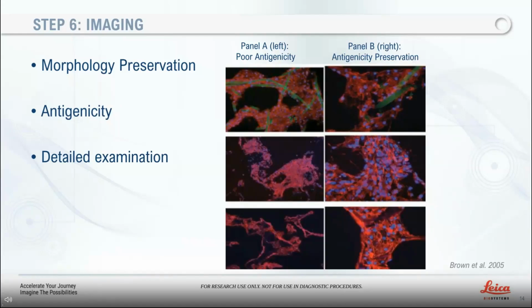Using cryosectioning for immunohistochemistry and fluorescent in situ hybridization allows for tissue with better antigenicity, makes your cutting much faster, and will create beautiful thin sections, even monolayers, that will provide the level of resolution needed at the imaging stage.